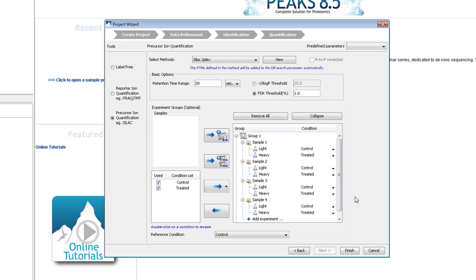The lightest label is always shown on top. This is a useful way to organize the display. Because, in this case, the fourth replicate was reversed. And the light label is the treated sample, and the heavy is the control. PEAKS will account for this.